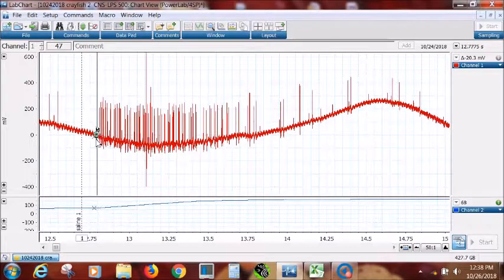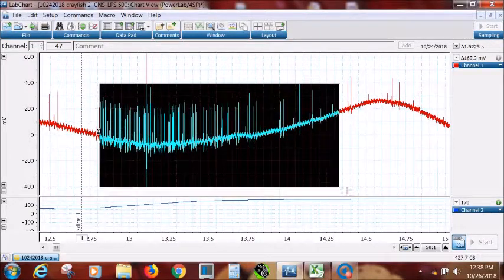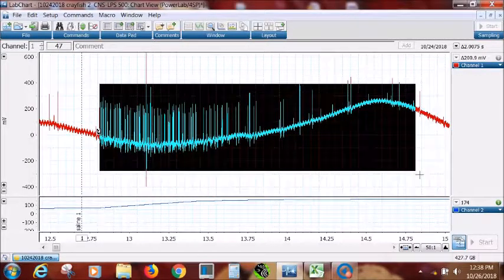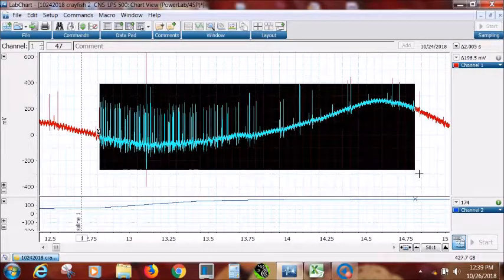Okay, so let's just move that right there, and like right there, there's 0. And now if we go over from here where it starts at 0 and we highlight that out to 2 seconds, getting it close enough for analysis, there's 2 seconds pretty much. Okay, and you might count that. We know we might be off at 1 count or something. This is why we average as well.